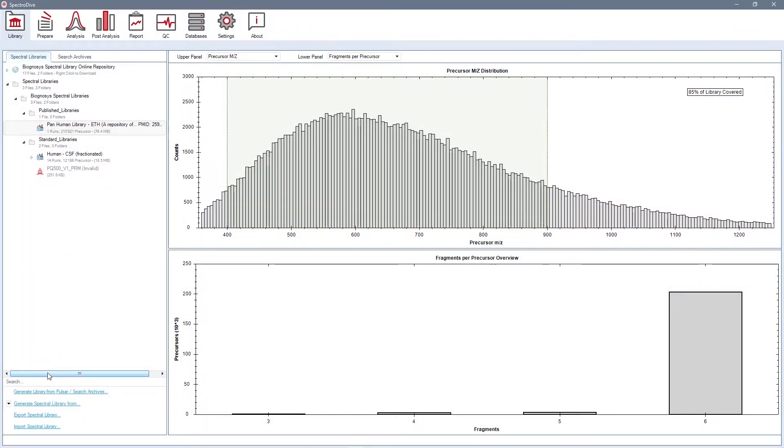In the library perspective, you can first generate a spectral library using discovery-like runs. SpectroDive comes with Pulsar, our database search engine that can create a library from DDA or DIA data.